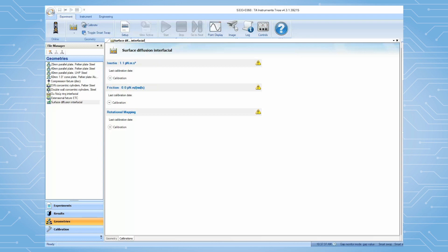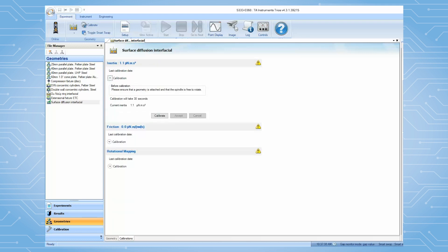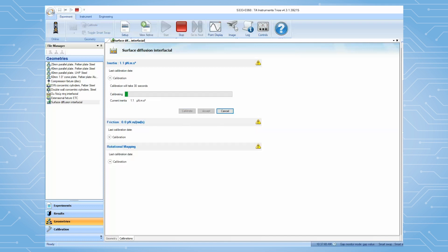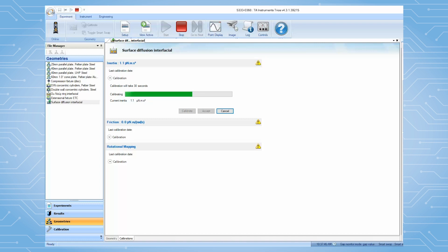Under inertia calibration, click on Calibrate to begin. This calibration takes about 30 seconds. After it is finished, click on Accept.